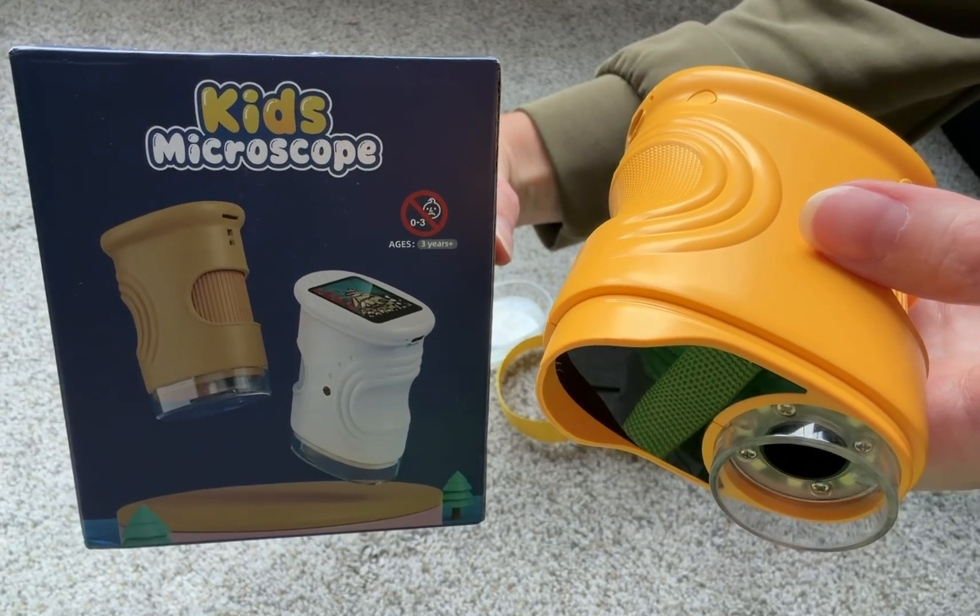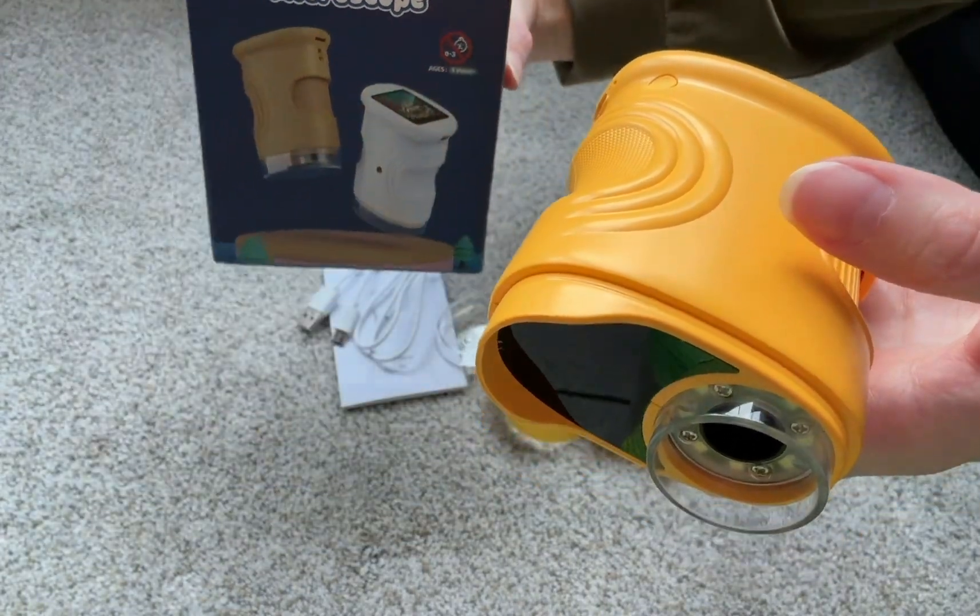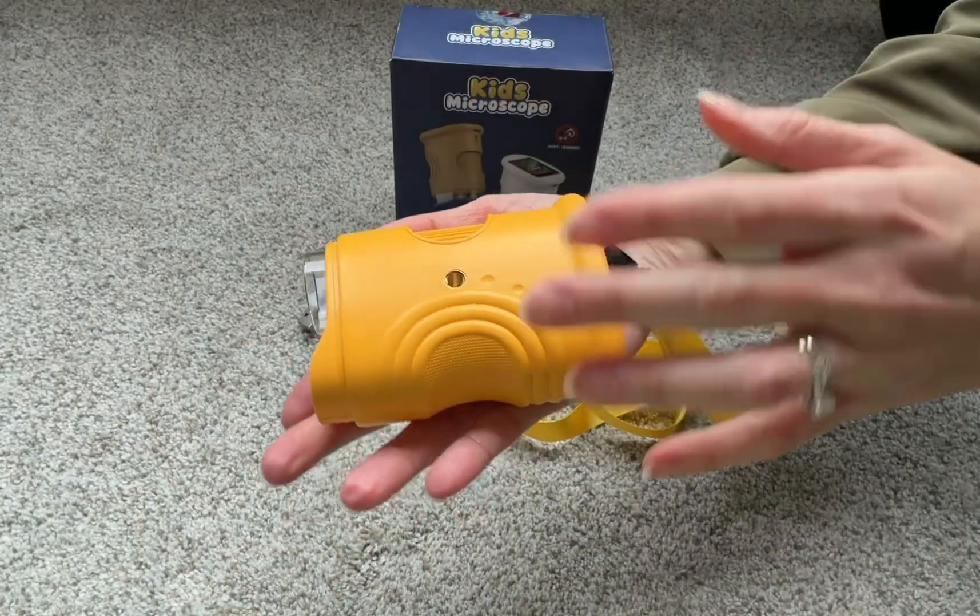If you have a kid that loves science and nature, this is a great gift idea — it's a kid's microscope. I was sent this sample to check out and review, and I'm going to go over all the features.